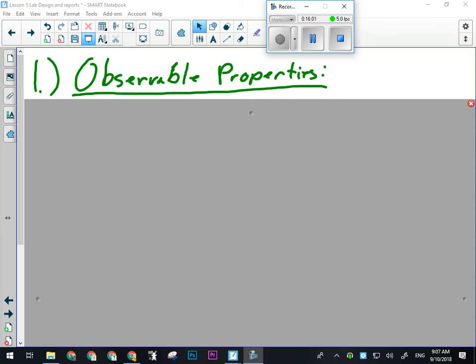When you go in there and you've done that, then you're going to come up to the front, and on a silver cart will be the equipment you need. One of those pieces of equipment will be this thing. This is a depression plate. It's not sad. It won't make you sad. It's called that because it has depressions in it. This is where you're going to put the unknown samples. But you're going to need to label this with a marker. So I'll have some permanent markers there that you can write like A, B, C beside the depression, so you know which unknown is going in which pit. So you put a little bit of each thing in there.